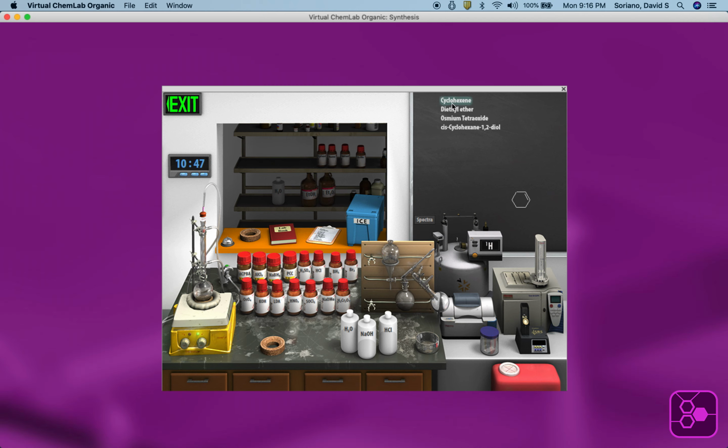You watch up there. See, there's your product forming. And you can tell it's a syn addition if you studied this in the organic electrophilic additions chapter. The osmium tetroxide is going to deliver by syn addition the cis glycol. And there it is. Now I'm going to go ahead an hour because there's still cyclohexene. And you can see after 1 hour's time, you can go up minutes, tens of minutes.